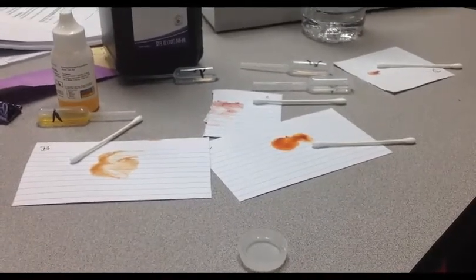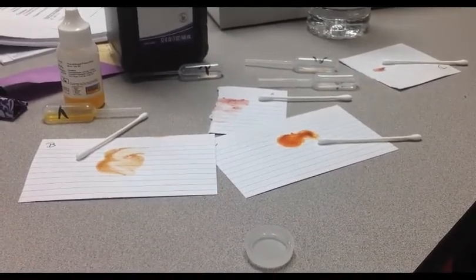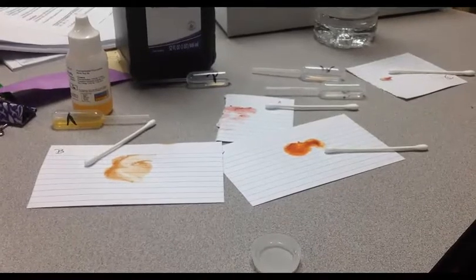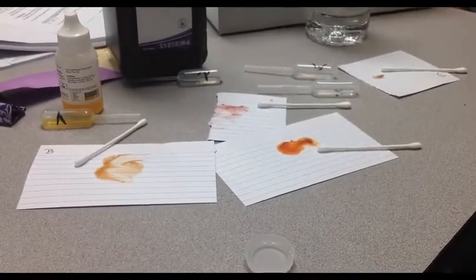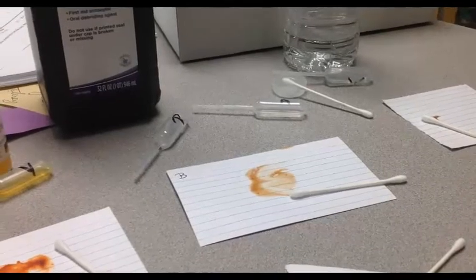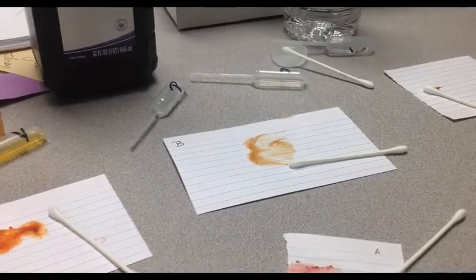There are several steps in this test. You will need water, alcohol, phenolphthalein, and hydrogen peroxide. The process is you'll take a Q-tip and wet it down with a little bit of water, a drop or two. You take the Q-tip and drag it across your stain. From there, you add a couple drops of alcohol.